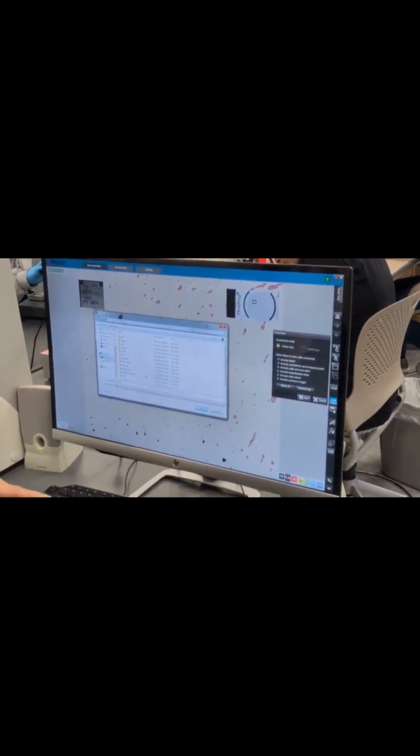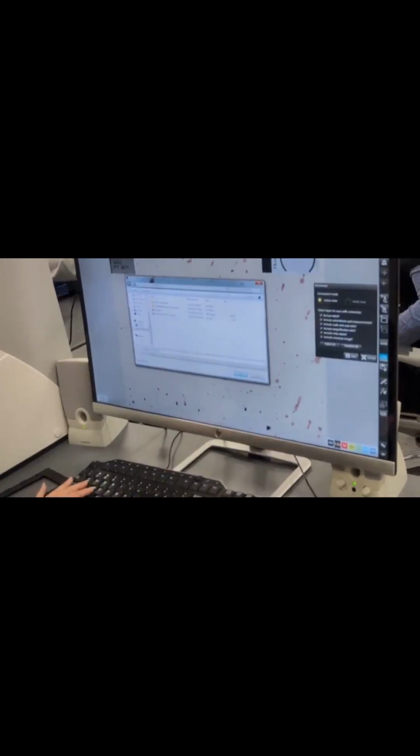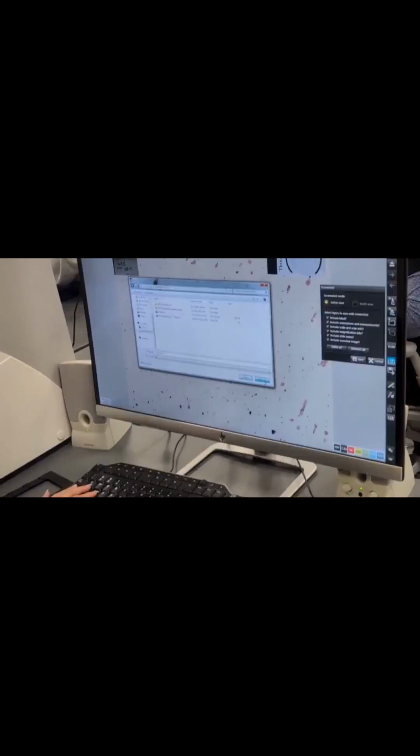And when you have your USB drive, you'll obviously plug it in at the bottom over here. And then you would just save it, like let's say it's this one, you would hit this, and then you would rename it like the tap stain, and you would save it to your USB drive and then hit save. Okay. And that's it. Cool. But yeah, so this is how you use it.